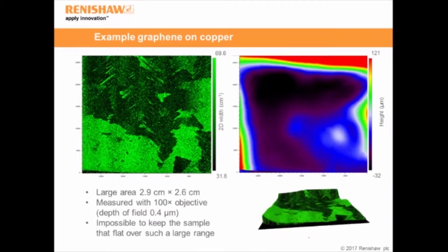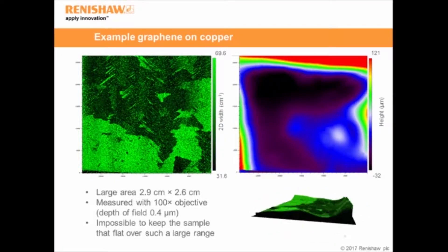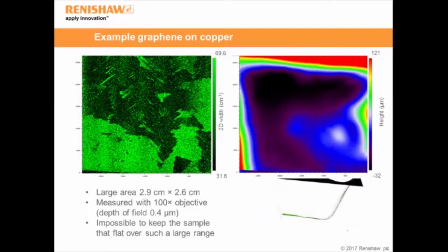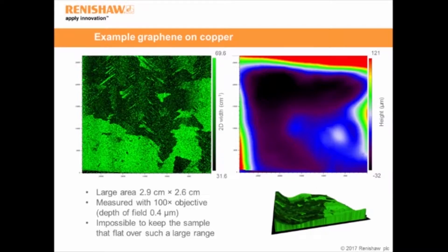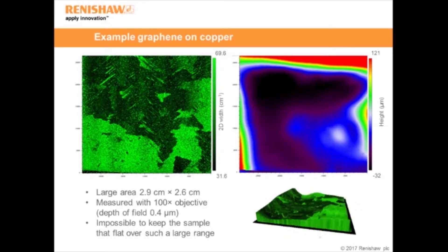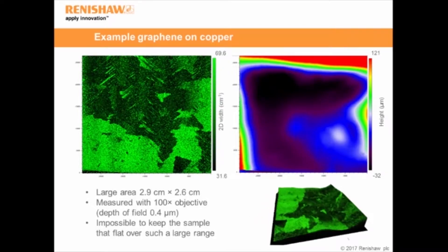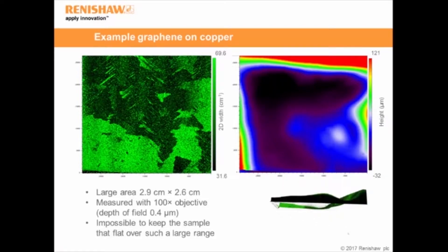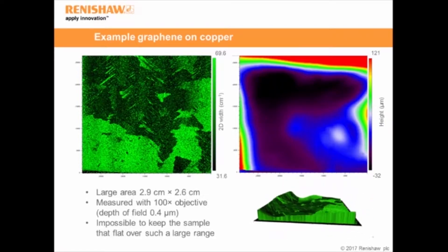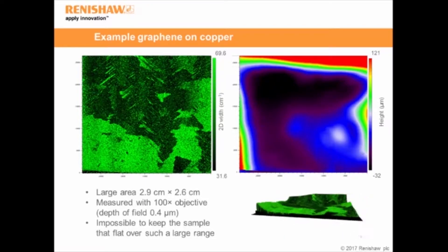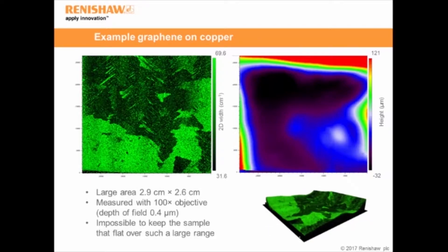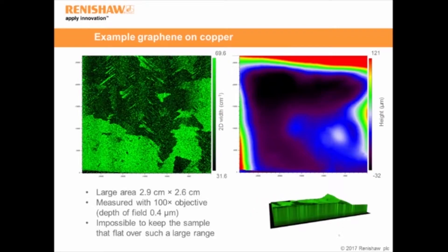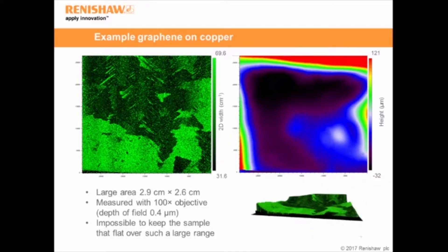That was a very small area of graphene on copper — approximately 30 by 20 microns. What I want to show now is how this technique can scale up to macroscopic objects. Here we have a graphene on copper sheet which is 2.9 by 2.6 centimeters. We carried out a Raman map over this graphene sheet using LiveTrack and a 100x lens. The image on the left shows the 2D width, which is an indicator of graphene film thickness — brighter regions correspond to many layers, darker regions to one or two layers. On the right we have a topography image showing the height changes across the area.